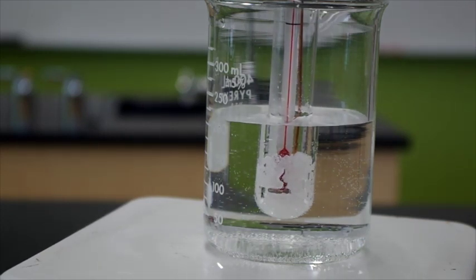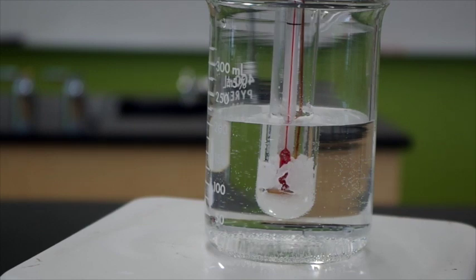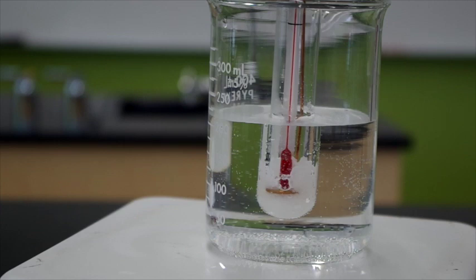You can see it starting to melt because the bulb of the thermometer is becoming visible. We have to increase the temperature a little bit.